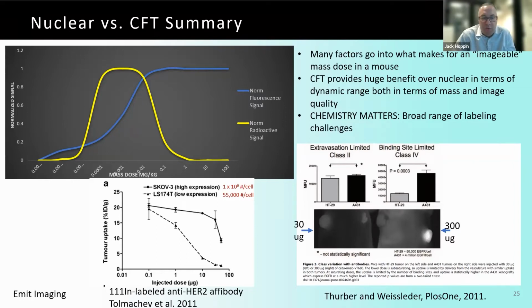You have a fluorophore. When we're radiolabeling compounds, we have one radionuclide per 1,000 to 5,000 to 10,000 molecules of the compound that we're working on. When we're doing fluorescence, we almost always have a 1-to-1. We not only have a 1-to-1 labeling, but each fluorophore can provide a lot of photons for us in our collection.